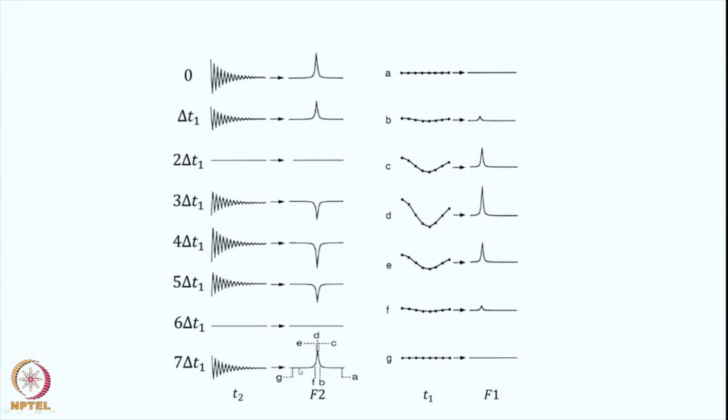So, you take all of these frequency points and join the individual frequency points and plot them here, and that generates a time axis. This variation is a representation of the variation due to the time T1. So, this also has a frequency component. Therefore, if I Fourier transform each one of these FIDs here, these are now indirect FIDs, right. These are not direct FIDs, you do not actually collect the signal during this. So, these are all indirect points.